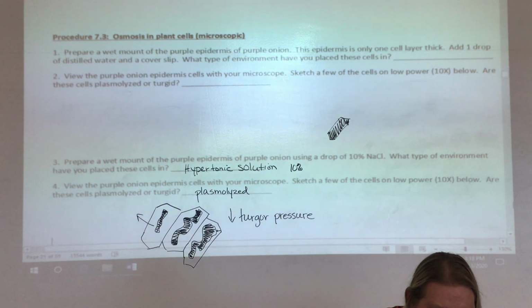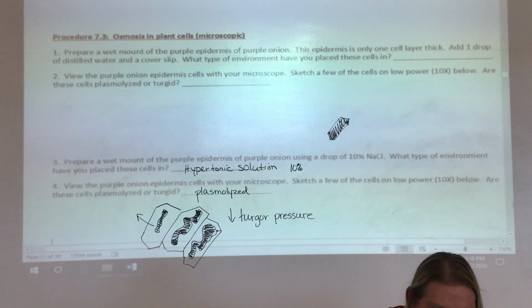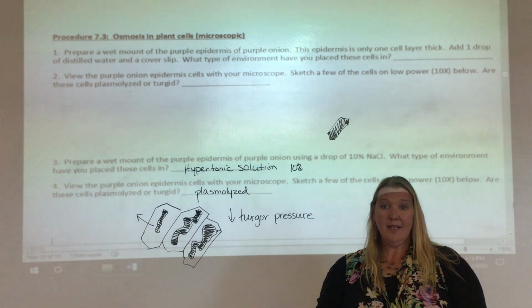Sorry about the delay. Maybe I'll pull a fresh piece of onion. Well, the onion is not cooperating.